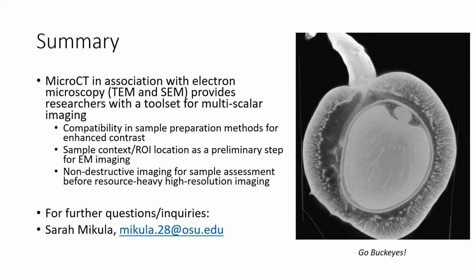How small you can get? Great question. 800 nanometers with an ideal sample on a good day. It's pretty good. It does require a small sample that can be very close to the source. So that's really ideal. Usually people are looking in the range of 1 to 10 microns for their pieces of interest, which is a pretty good starting point if you want to do further work.